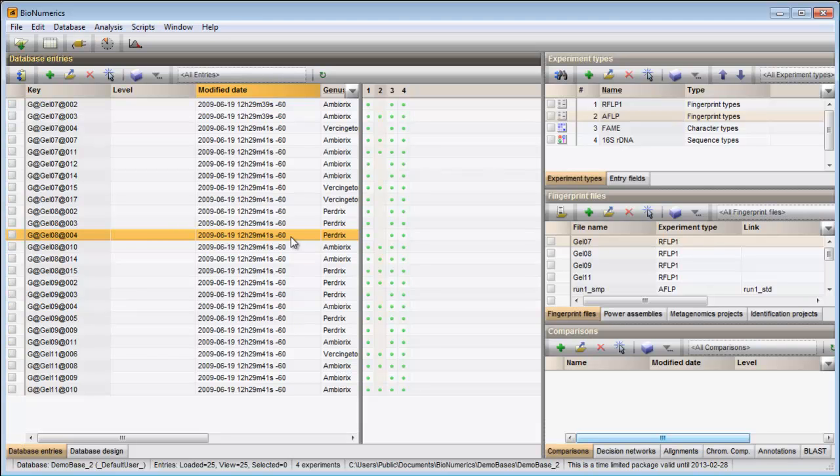Entries can also be selected using the Google-like search function in Bionumerics. This might be useful when working in a large database. The search tool is launched when pressing this button in the toolbar.